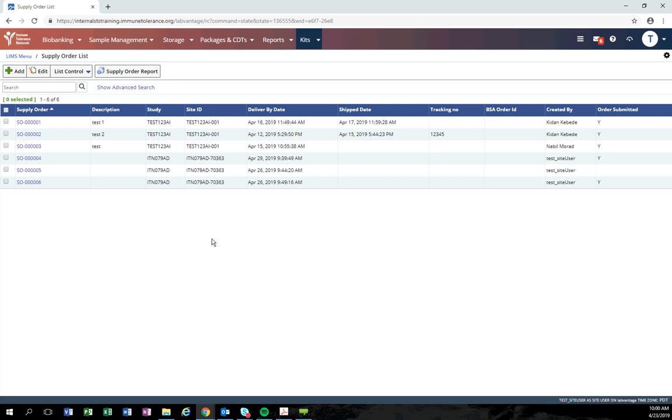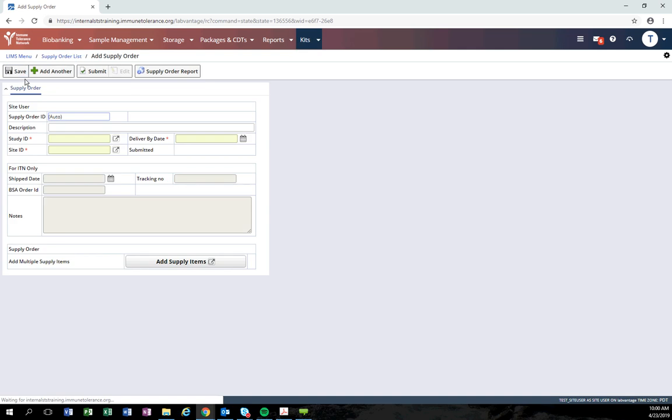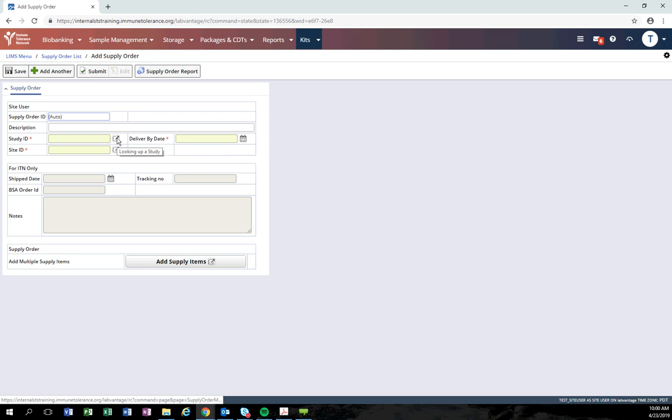To add a new order, click the add button. There are three required fields that must be entered before you can enter your supply order items. First, select the study you want to create a supply order for.